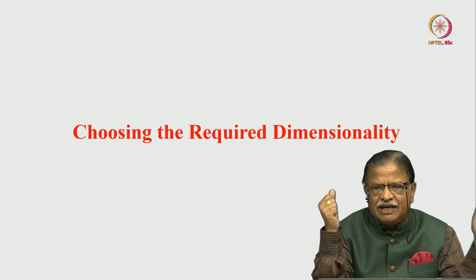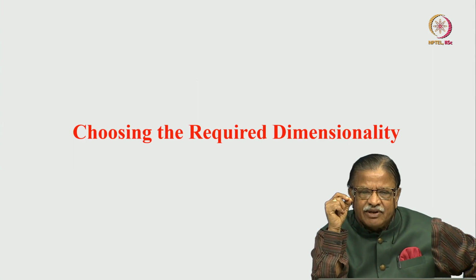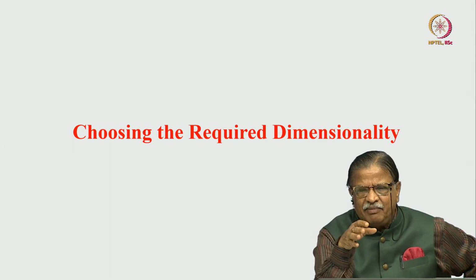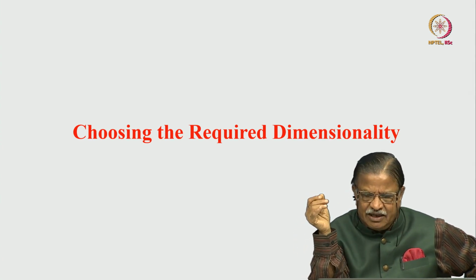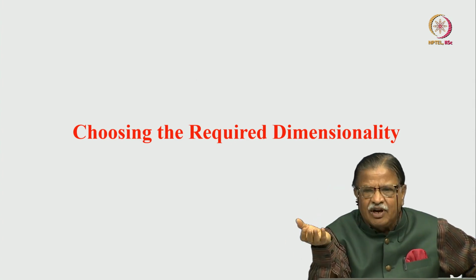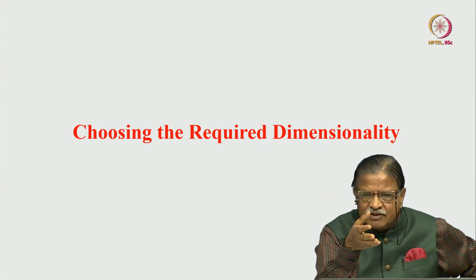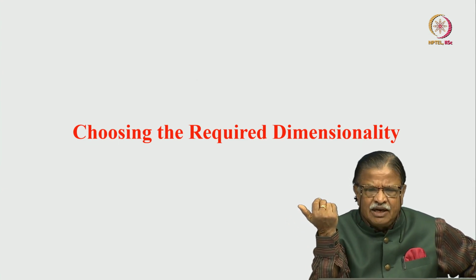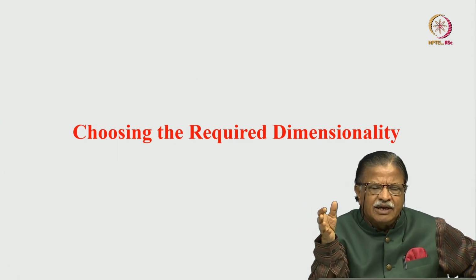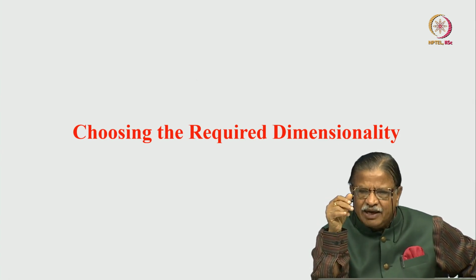But in this class, we started with understanding what a 2D NMR is. What defines dimensionality? I said dimensionality is defined by the time. An experiment, a pulse sequence with n time periods, with n minus 1 incremented, only one time domain being constant, is going to give n-dimensional NMR. We have n time periods, you do n-dimensional Fourier transformation and you get an n-dimensional frequency spectrum. And we can have different ways of representing the 2D data. It was stack plot and contour plot. Stack plot is outdated. I showed you how we can use the contour plot. In a contour plot, the area of the contour is nothing but the integral area of the peak in the stack plot. So we can use that.